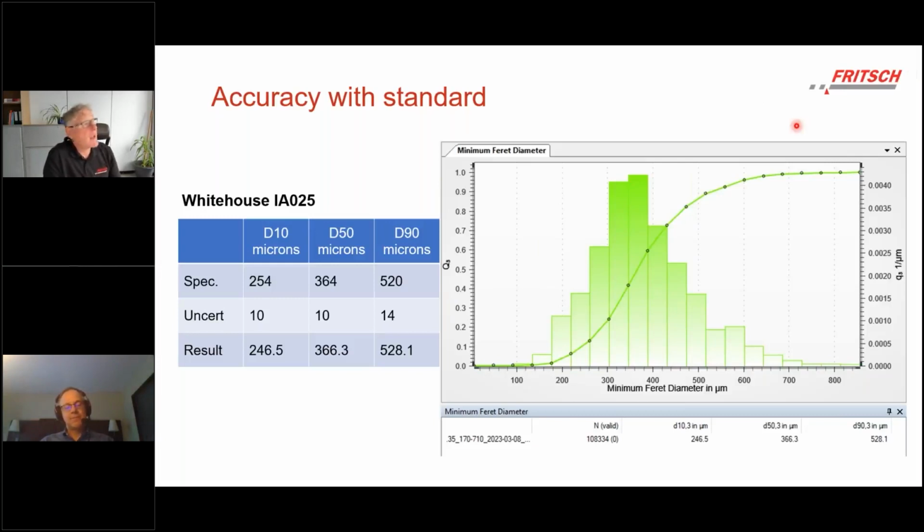Maybe about inline, well, this instrument is not designed for inline. This is a typical laboratory instrument. With some effort, it is of course possible to implement it or to integrate it into a running process for doing inline measurement. The challenge then typically is to get the correct sample. This is sampling again, the correct sample out of your material stream, and feed it to the instrument.